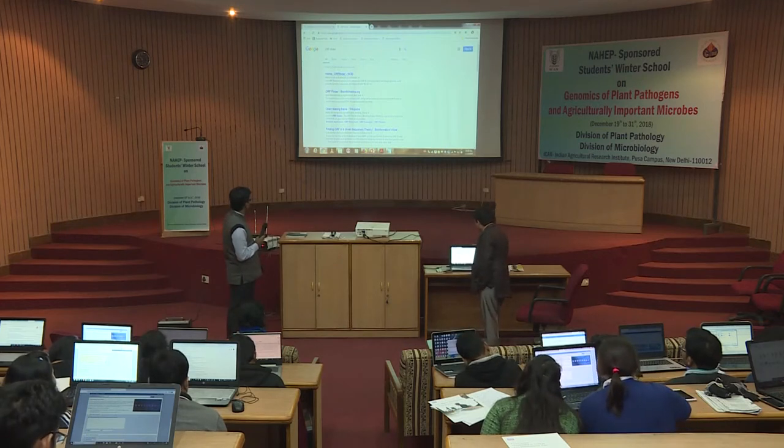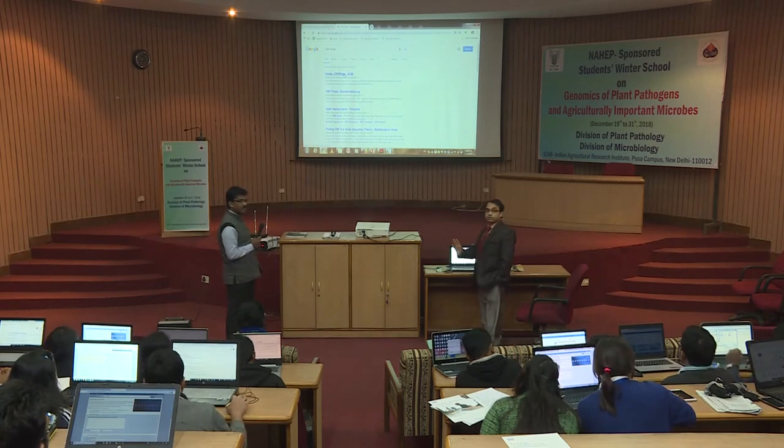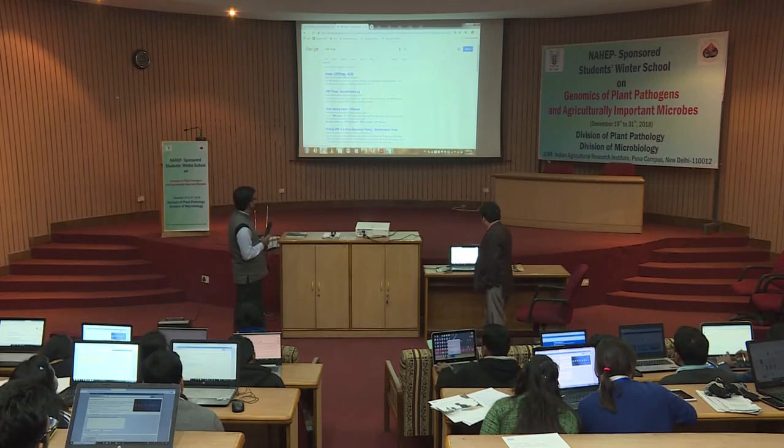In NCBI, one service is given for this. There are many other tools also, it is not that there is only one, but due to time restriction we will show only one thing, and that is ORF Finder.